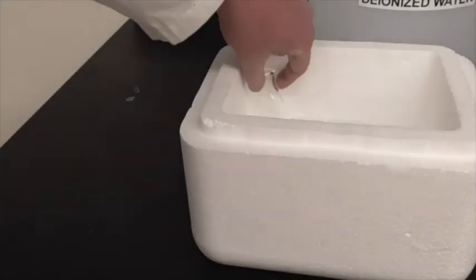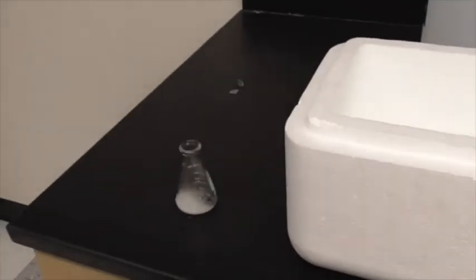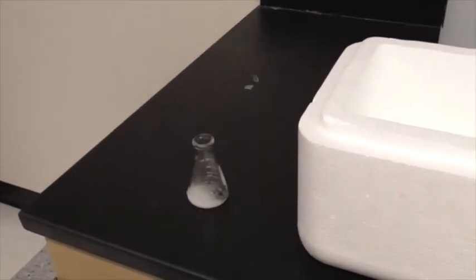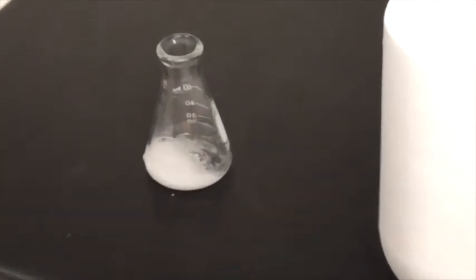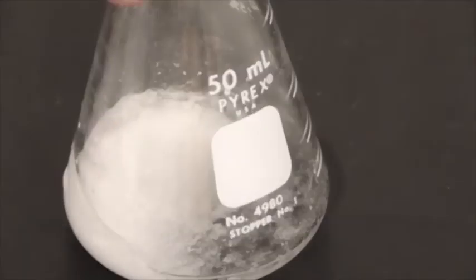Alright, so we're back at the ice bath here. I'm going to pull this out to show you what we've got. So you can see all of the white solid in the bottom is actually our precipitate, our aspirin.